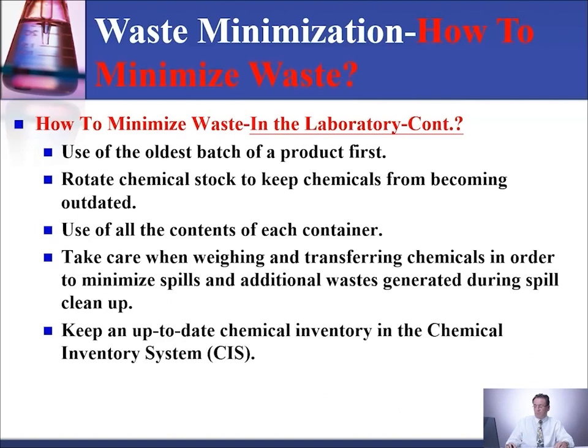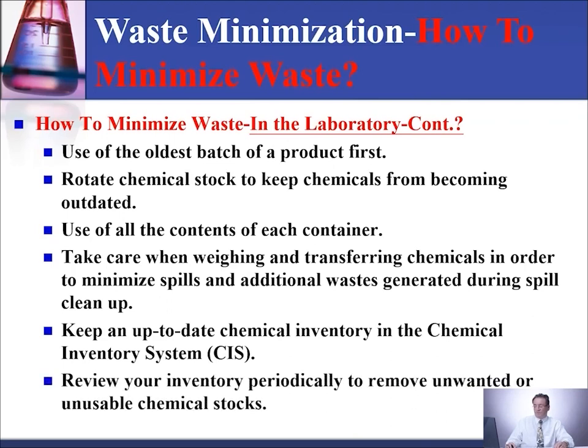Keep an up-to-date chemical inventory in the chemical inventory system. Review your inventory periodically to remove unwanted or unused chemical stocks.